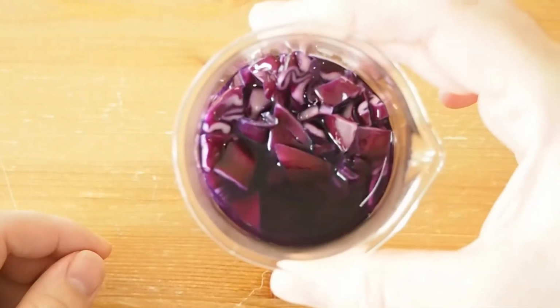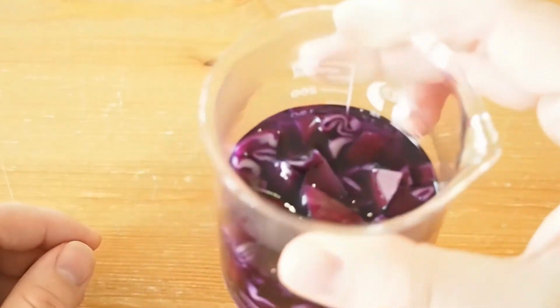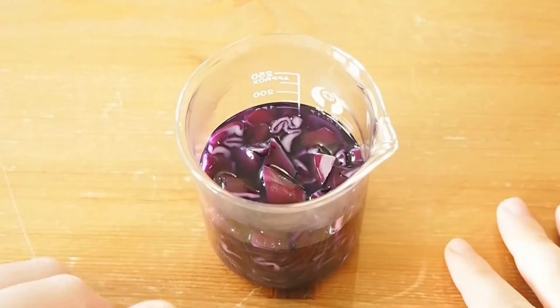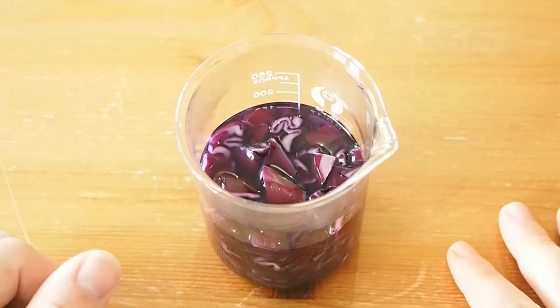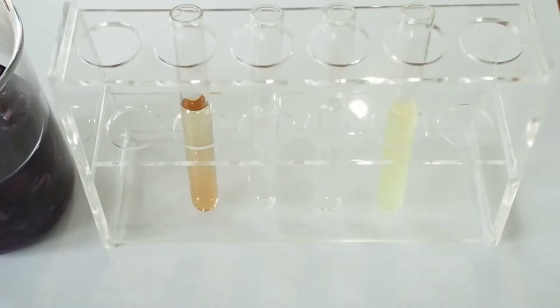There you can see we've got this beautiful, rich, purple solution. That is our indicator. That's super easy. So, let's test it out. So, I have a number of test tubes here. Now you could just use little glasses or something like that for this, but I've just got a number of test tubes with some solutions in.